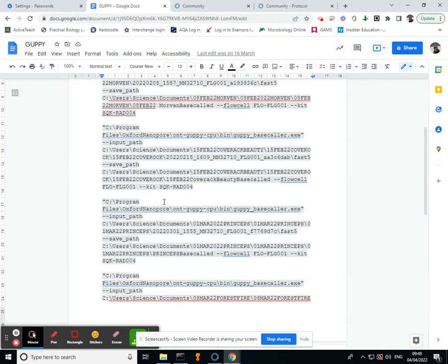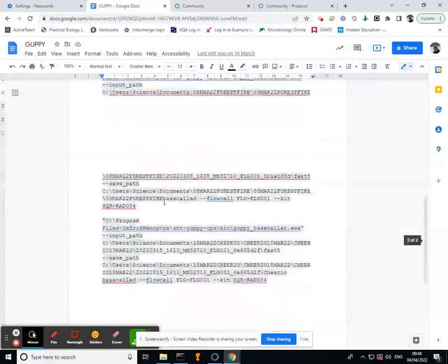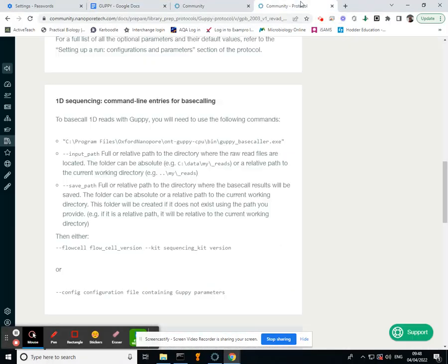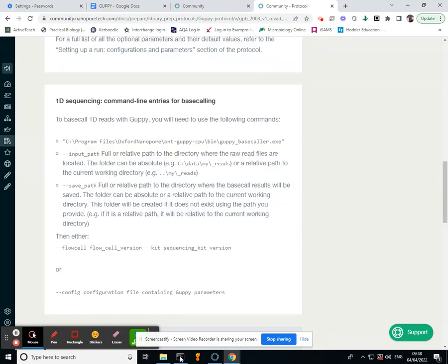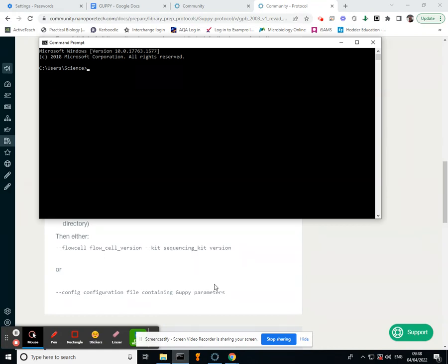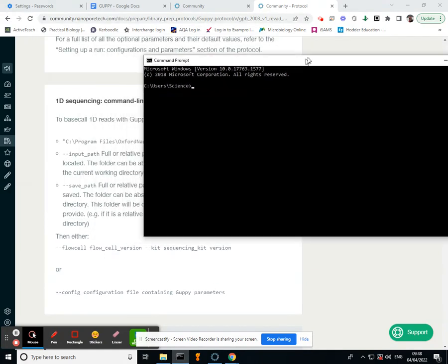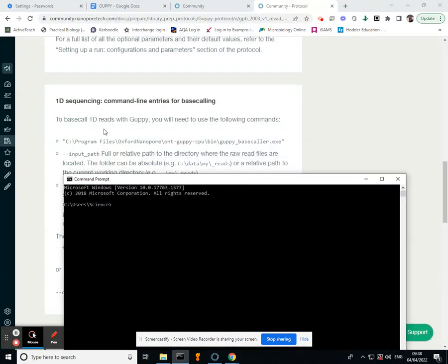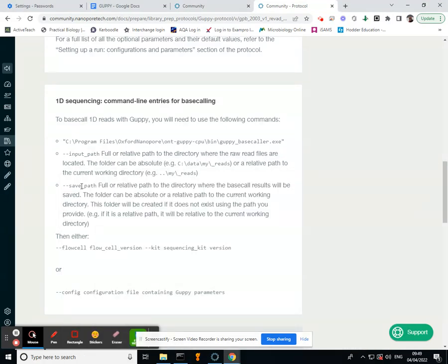So in here we've got this—all this needs to come into your little black box and it's going to be pasted. We've got our input path and our save path.